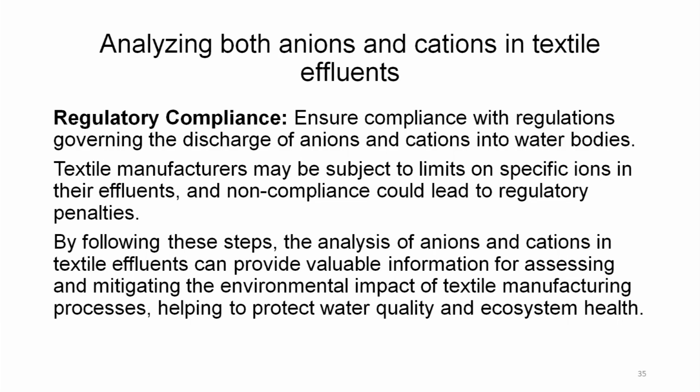By following these steps, the analysis of anions and cations in textile effluents can provide valuable information for assessing and mitigating the environmental impact of textile manufacturing processes, helping to protect water quality and ecosystem health.